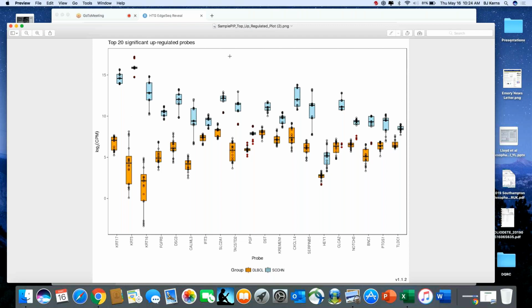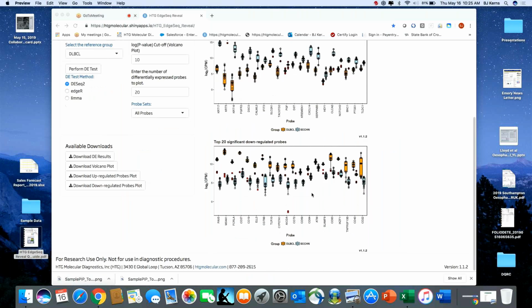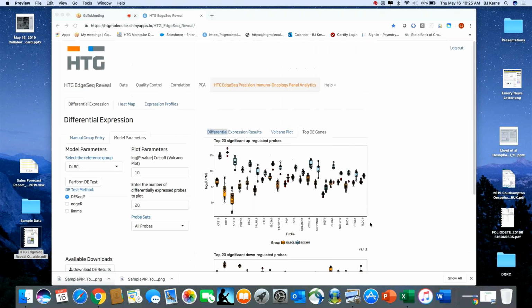It's really just giving you the ability to see your trending data versus your true statistically significant data. So again, things to watch out for: the title, what the data is actually telling you, along with the spacing or scaling of your actual logs.